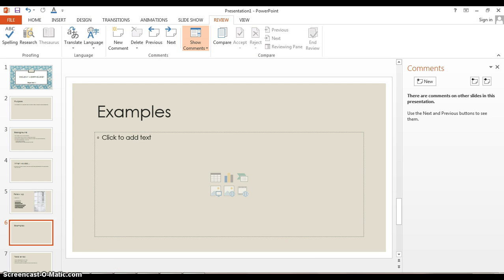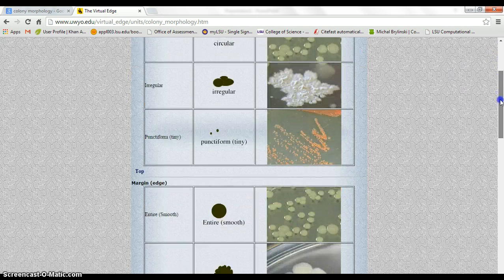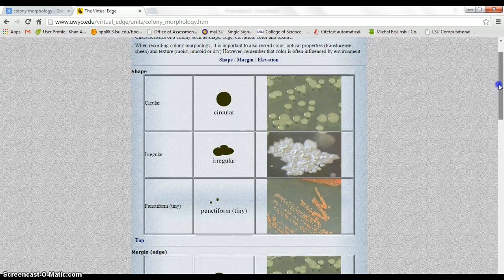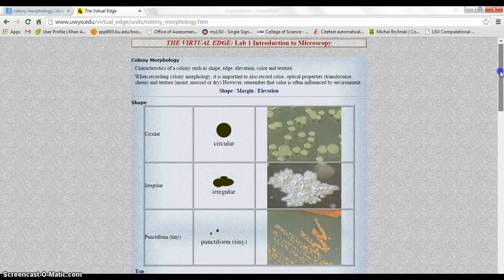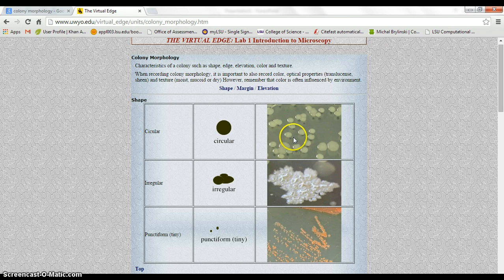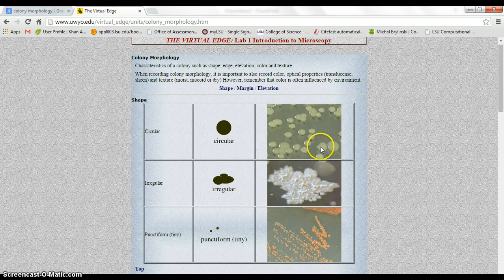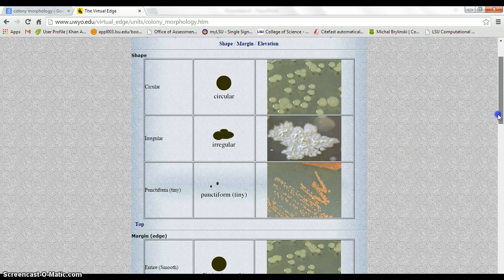And so, we're going to look at some examples. You can find more examples because we're not going to be going over them but try to look for examples of each colony type before you take the test. We're just going to be going over a couple here. So this is circular. You want to be looking at each individual cell and see this is circular, that's circular and so this is on general circular. The irregular one, it just kind of looks like a cluster of everything. Punctiform, you don't need to know. That's not in our lab manual.